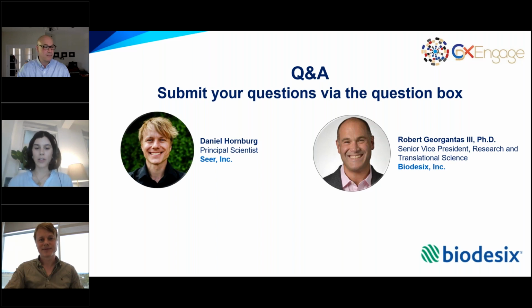Thank you, Daniel. And I think there's another question for you here. So is the Seer proteograph primarily used for protein identification, or can it also be used for targeted protein quantification? So that's an excellent question. The Seer proteograph works very much upstream of whatever you do downstream with your samples. So the current product is designed with a mass spec readout in mind. So you end up with your peptides that you can inject into your mass spec, but the particles enrich and, better to say, compress the dynamic range of all the proteins.